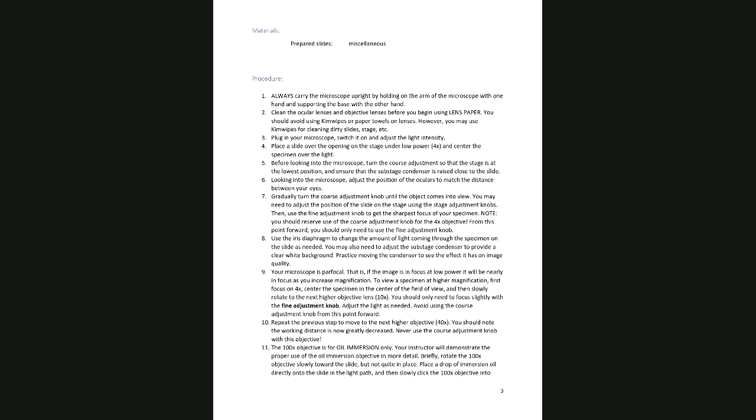Right, to remove the slide that you just finished looking at, and you want to look at a different slide, how would you remove the first slide? And don't be shy. It's okay to be wrong, because most of you probably will be wrong. So how do you go about removing that first slide, right, to prepare for the next slide? What do most students do?